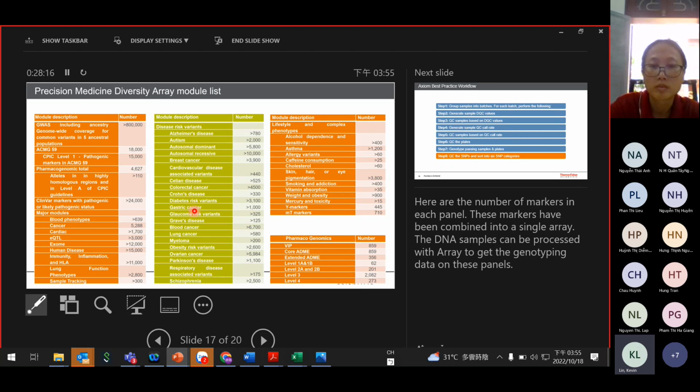But for example, here we have standard and non-standard. So maybe you have the VIP markers on the right hand side. For the VIP markers, we may design many replicates. However, for some common markers, we don't have to put replicates. You just put one marker for this variant.